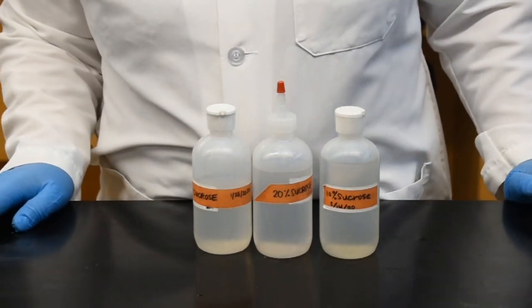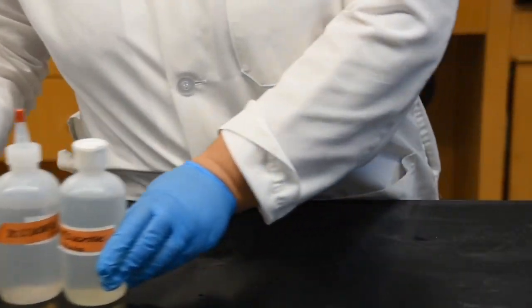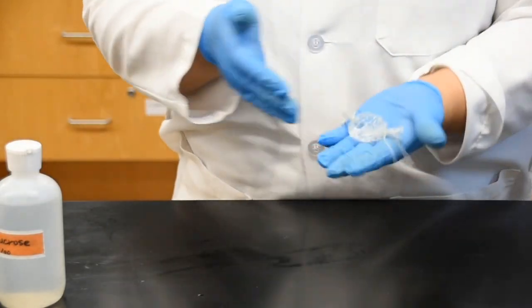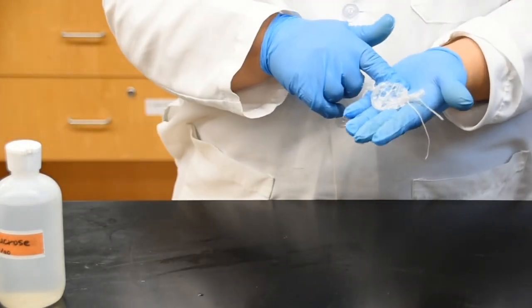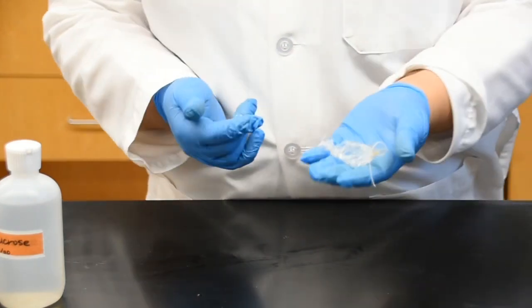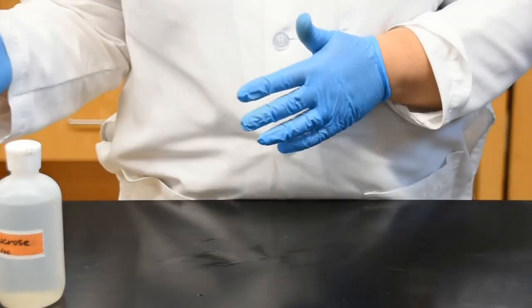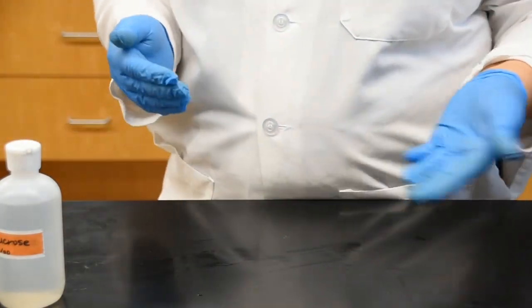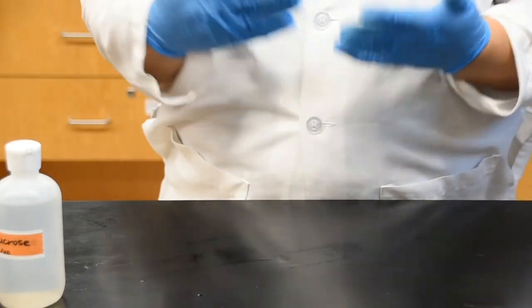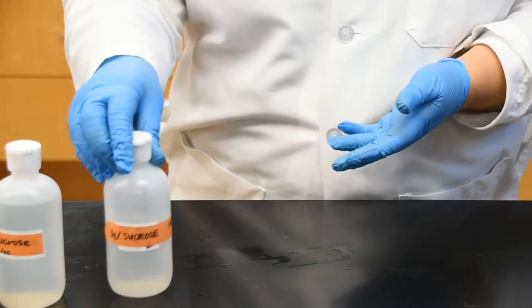Now for us to figure out what our osmotic pressure is and answer the question, what I have done partially is we have created these little baggies. So this baggie that I have is a 10% sucrose solution. I have another one which is a 20% sucrose solution. And I'm going to show you how to actually make the baggies, since I haven't shown you. I'll show you in a second how to make the baggies with our 30% sucrose solution.